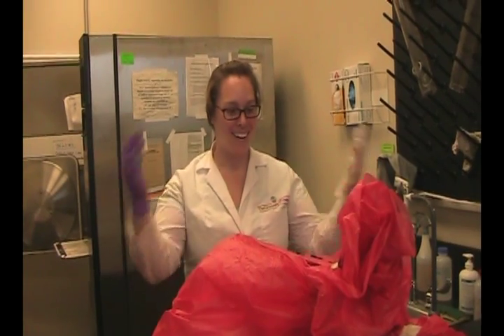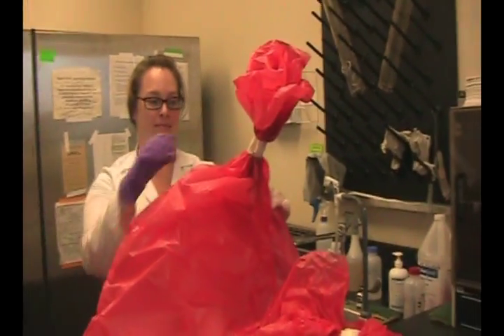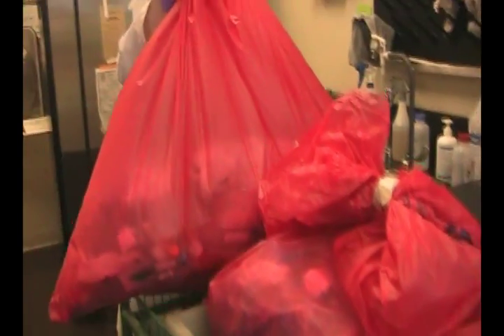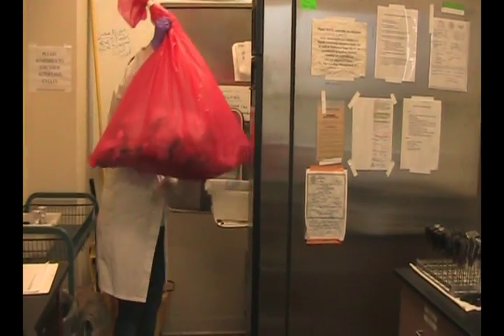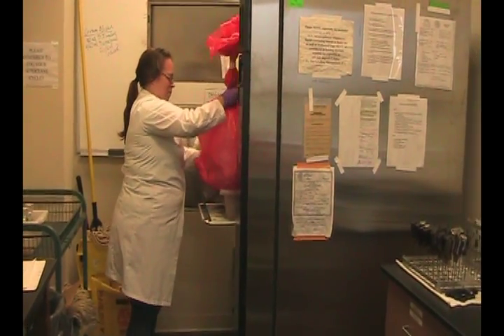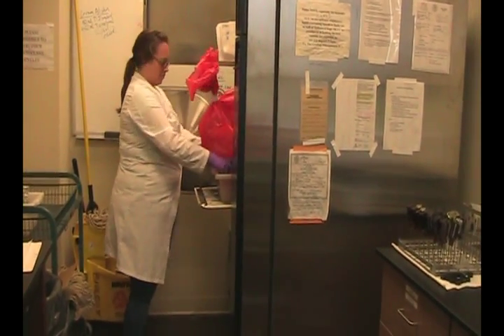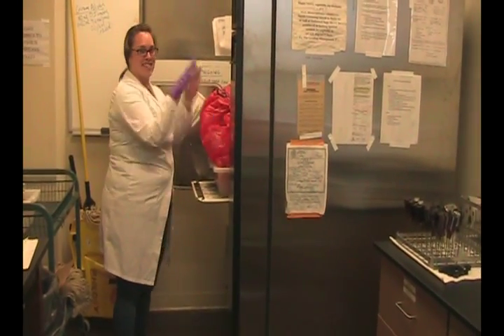Now Tiffany will demonstrate the proper way to autoclave waste. You'll notice the bag is not twisted tightly — it has autoclave tape around a gathered top. They need to be put in the large Nalgene buckets. You want to make sure the bag is inside the bucket.